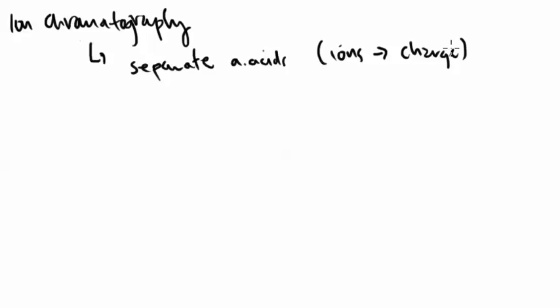We already discussed the concept of these amino acids carrying a charge. They carry a positive or negative charge depending on their pH. So yet again, we're seeing a pH dependency that we have to put into place if we want to analyze these amino acids.